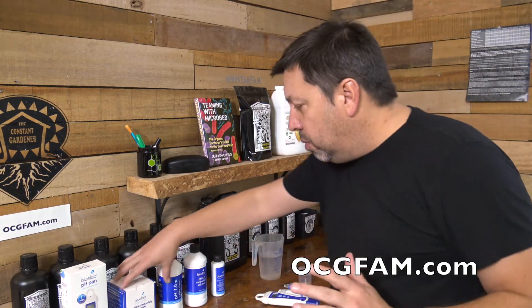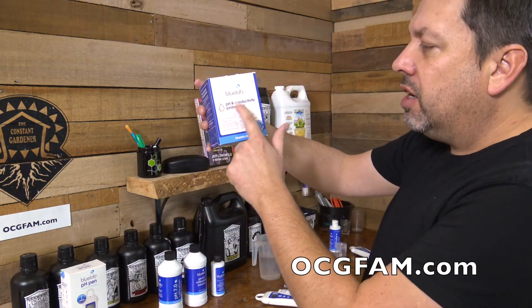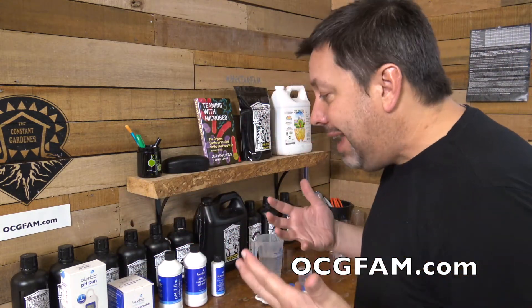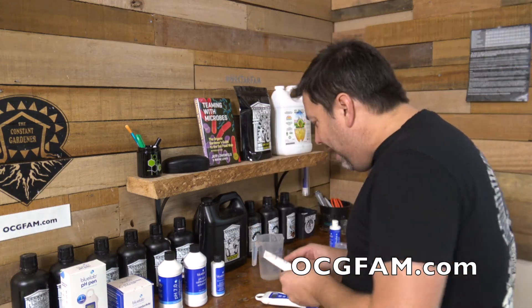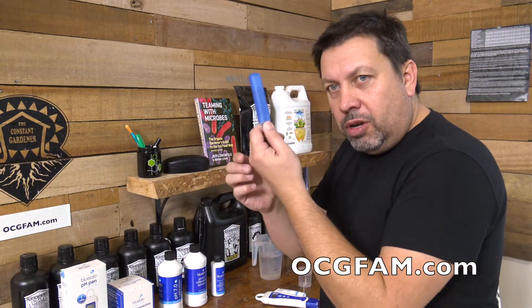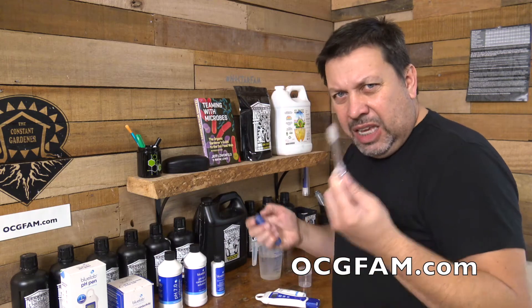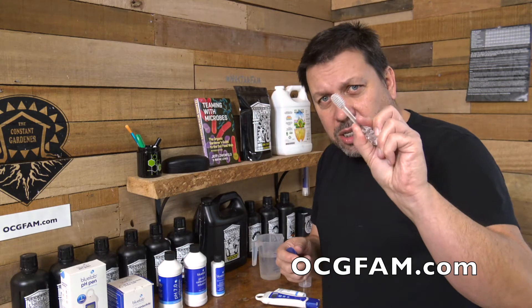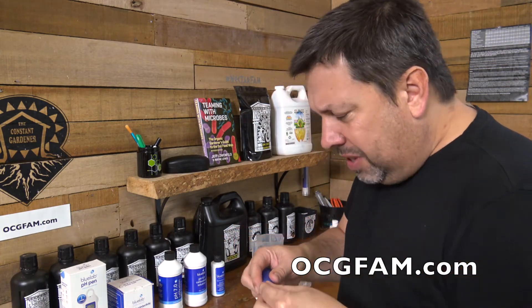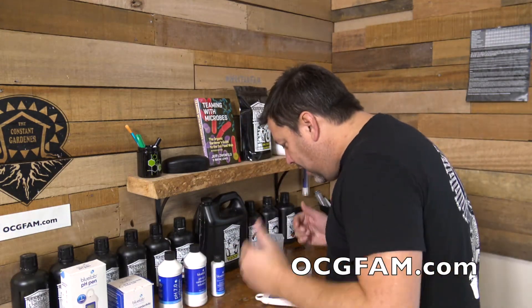Before we talk about cleaning it with the kit — the pH and conductivity probe care kit — if you don't want to spend the money on the kit, you can probably get away with some mild dish detergent instead of the probe cleaner. And instead of their little toothbrush, you could go to Walgreens, Walmart, order on Amazon, or your local drugstore and get a soft toothbrush and you'll probably be just fine. But that's not what we're going to do because we're big time here — we're going to use the kit.